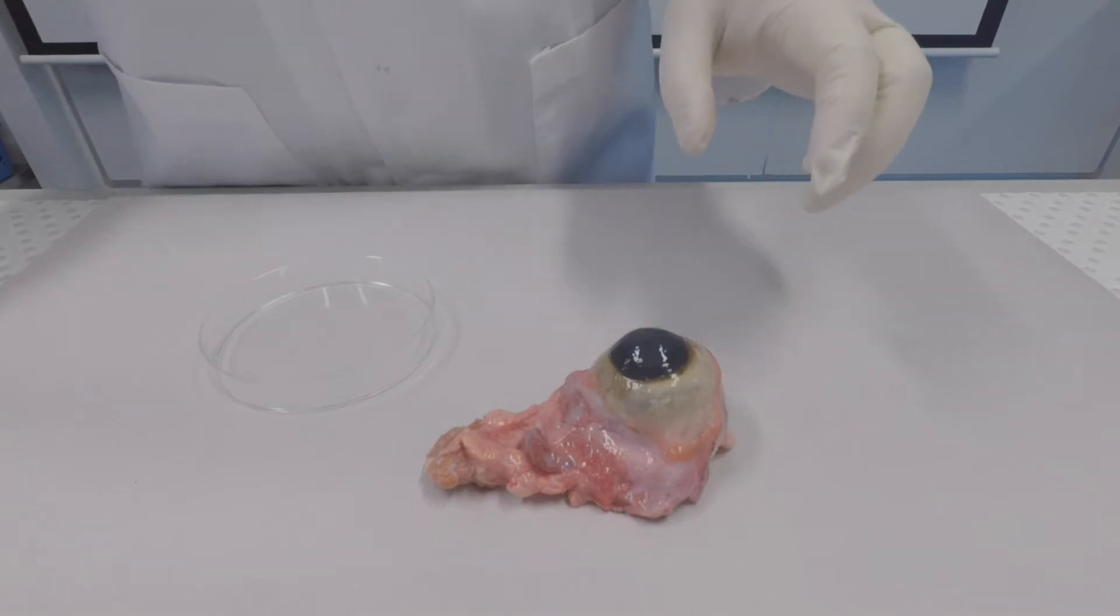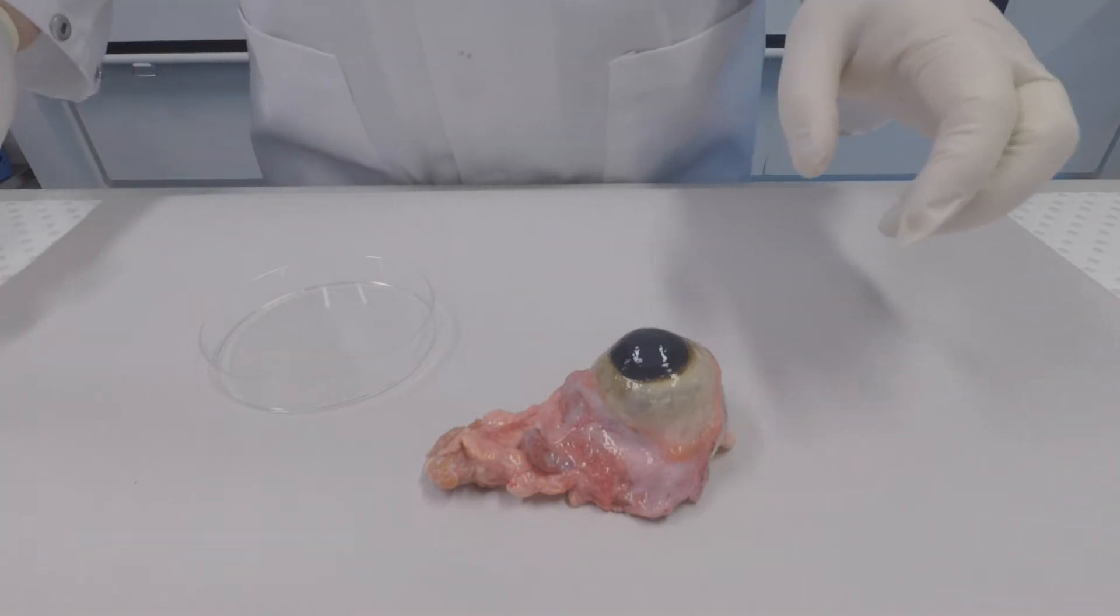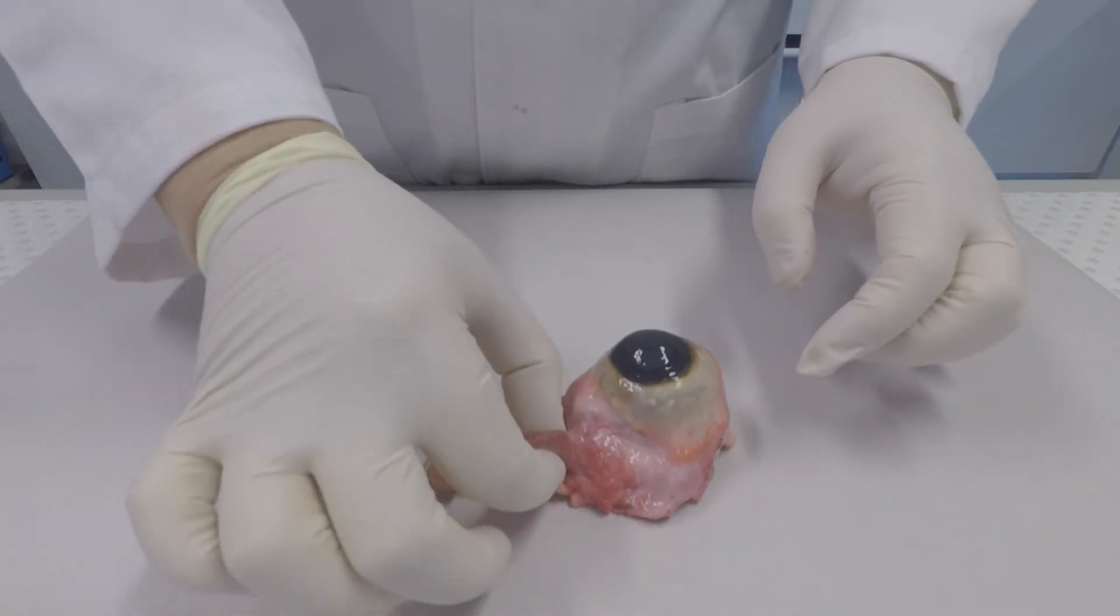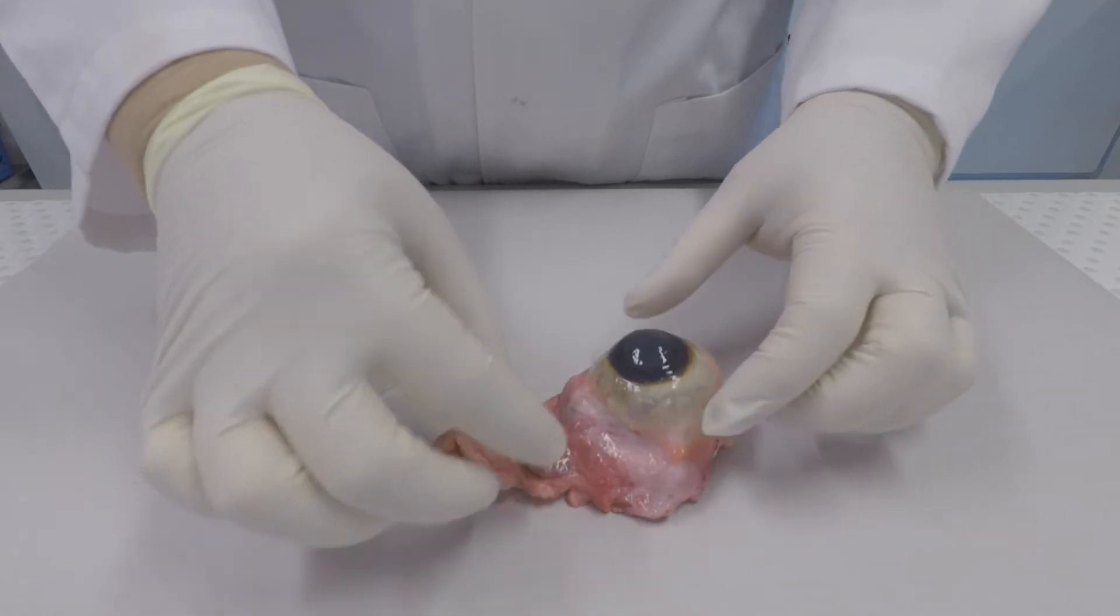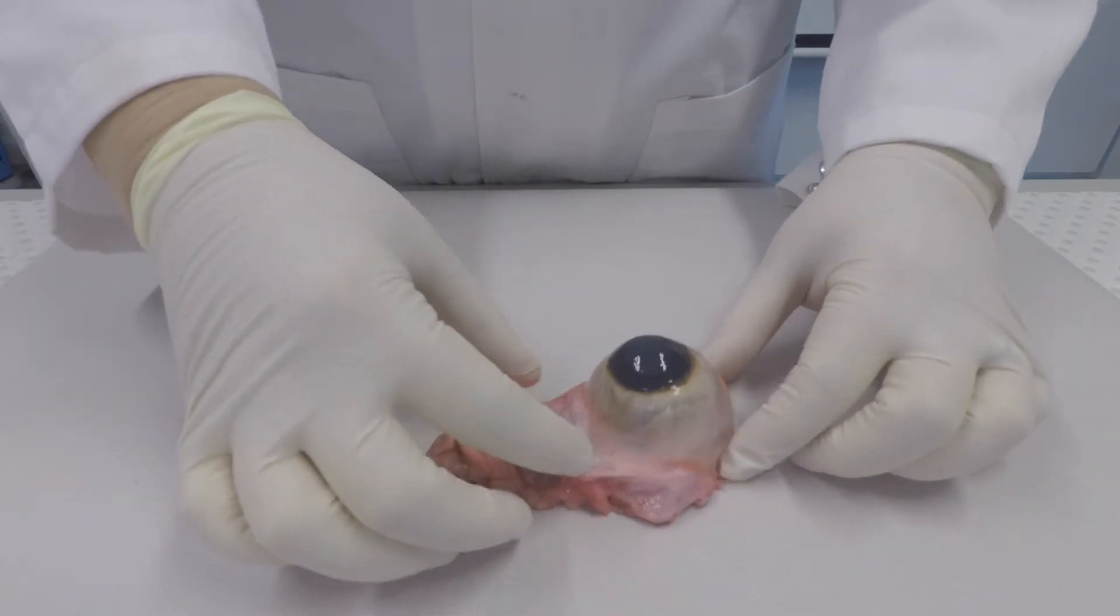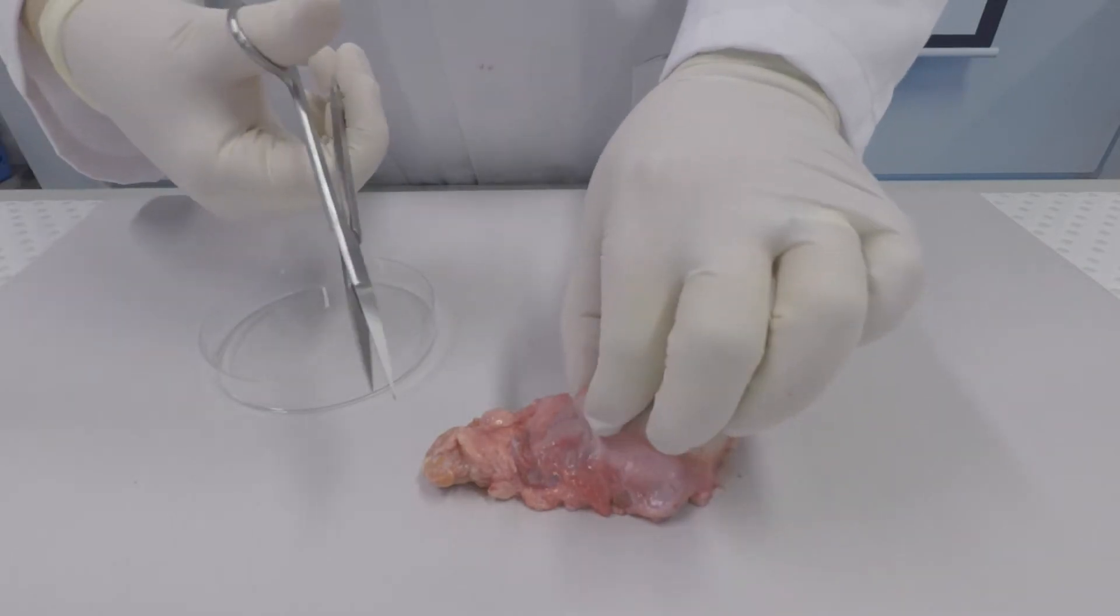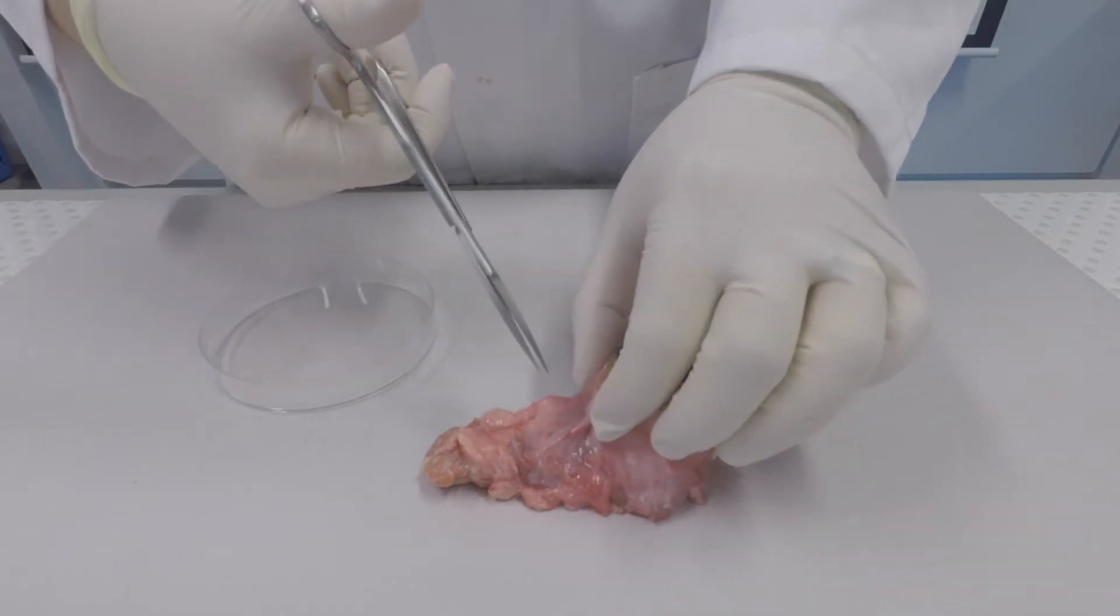Today we're performing an eye dissection. This is a bovine eye. You can see that the eye is surrounded by a lot of fatty tissue and there are muscles attached to the eye. These muscles help to move the eye up and down, left and right.